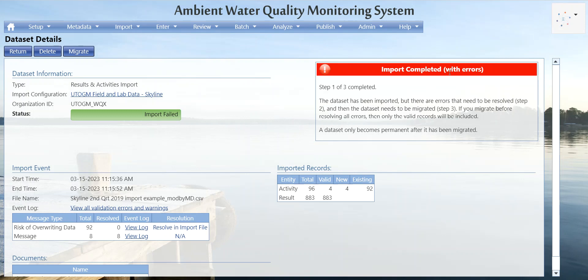For demonstration purposes, let's say you were able to resolve all the errors. The status would turn yellow and say the errors are resolved and the data set is ready to be migrated — step two of three. A button labeled Revalidate Changes would appear between Delete and Migrate. You'd click that to refresh the valid record count, and then click Migrate.